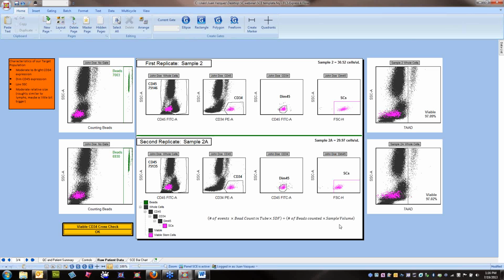It's 100 microliters. Okay? And then you'll see here that we have a text box where we entered what we call tokens. Tokens are dynamic text that update according to the data in your analysis. It could be as simple as the amount of bead events or my percentage of CD45 cells. Or we can actually use tokens in the creation of what we call custom tokens. So if we wanted to have a mathematical formula represented in our analysis, we can make a custom token where we enter all of these individual statistical tokens to give us an overall product.